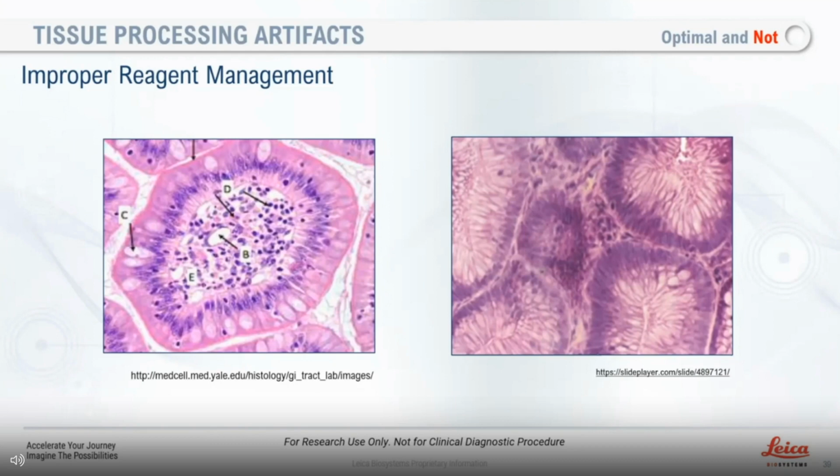Okay, thank you. You bet. Next question. How critical is it to utilize the warm water flush program on your tissue processor? If so, how often should you be using the flush program?